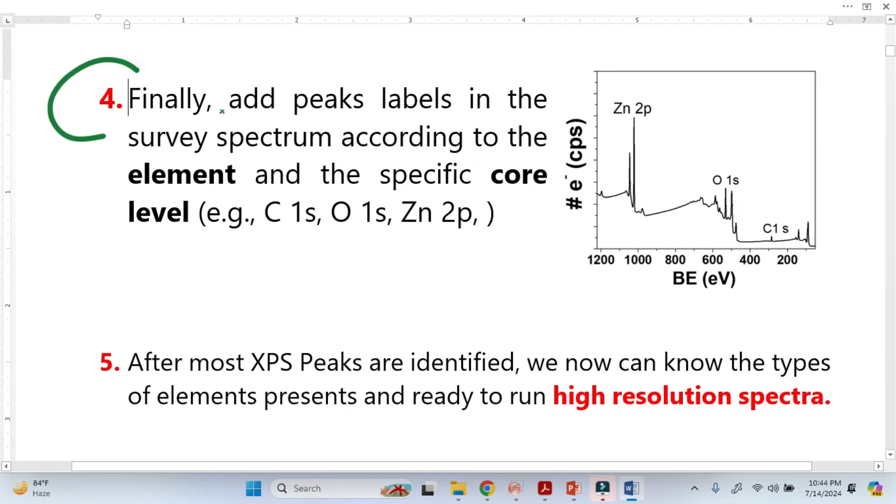So now in step four, as I mentioned, from binding energy tables we are able to identify the elements. So now just give the names: that this peak was from zinc, and that peak was from oxygen, and this peak from carbon.